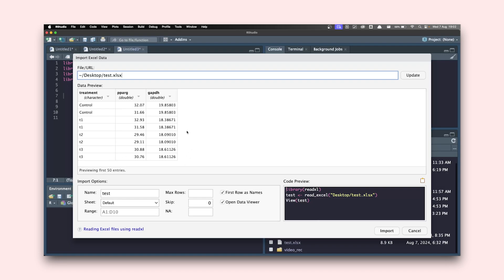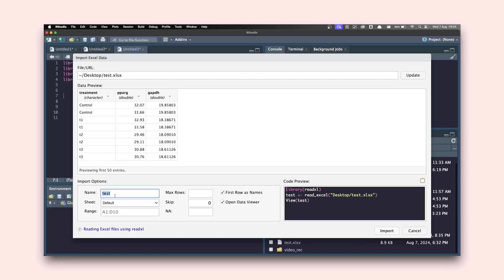This is the data we're going to be working with. We have GAPDH, which is the reference or housekeeping gene, and another gene called PPR gamma. We have four treatments including control, T1, T2, and T3. Every treatment has a duplicate value — two for control, two for T1, and so on. I'm going to name this object pcr_data, otherwise it will take the name of the Excel file itself. I'll also uncheck 'open in data viewer'. Once done, you can see the name has changed.